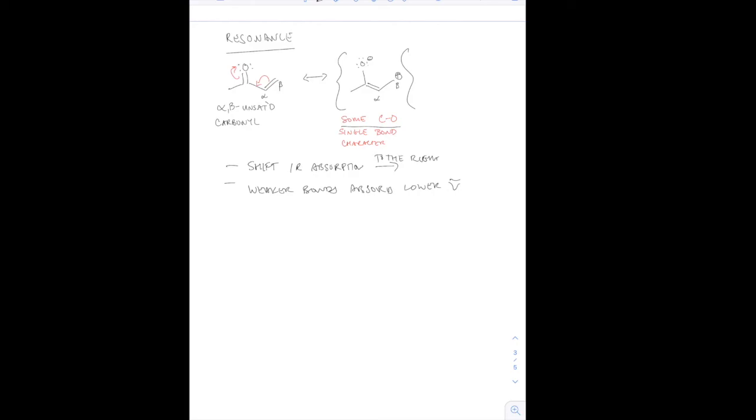And this is a very common thing that we're going to see. Now this can actually translate to a variety of compounds. I don't know the word I'm looking for, but it can look quite different depending on the overall structure of that particular alpha beta unsaturated ketone, or something else that can be really heavy on the resonance structures.